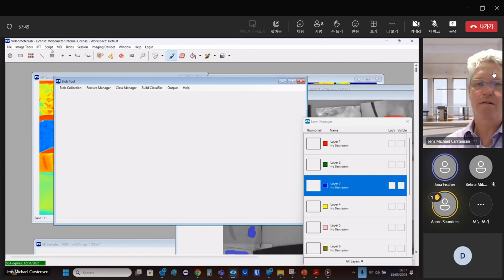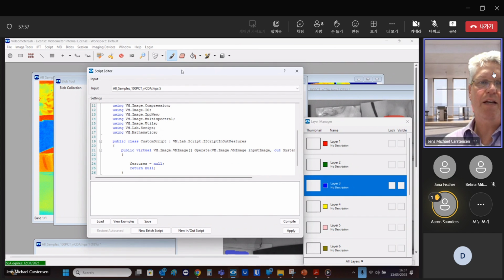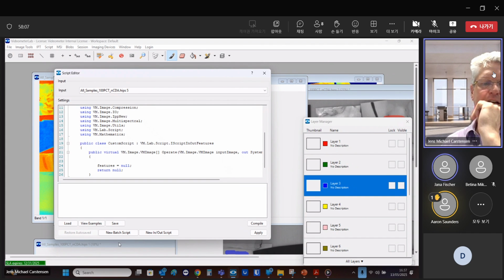You just mentioned that you're going to change. Does that mean that export function is going to be removed? No, it means that it will be easier in the future. So let me show you how it is today. Then I can explain what we are about to do.